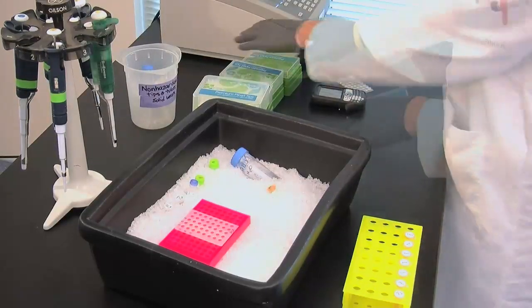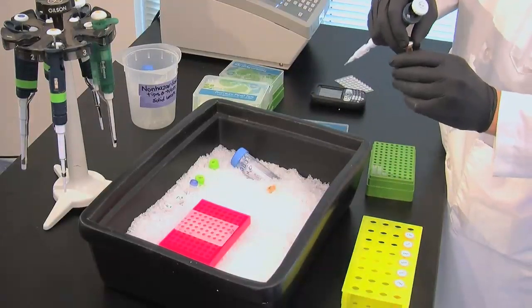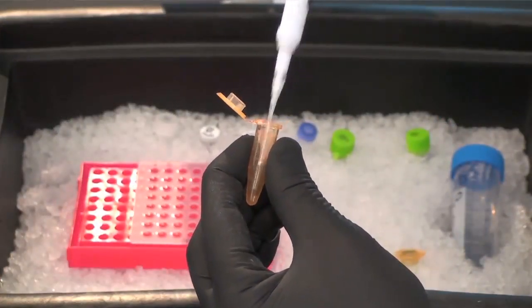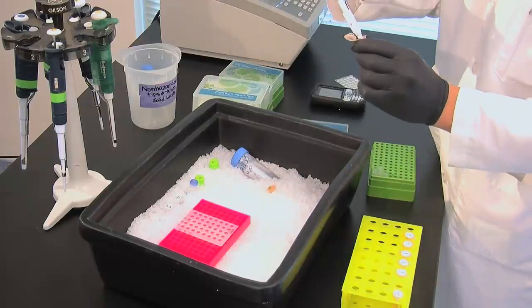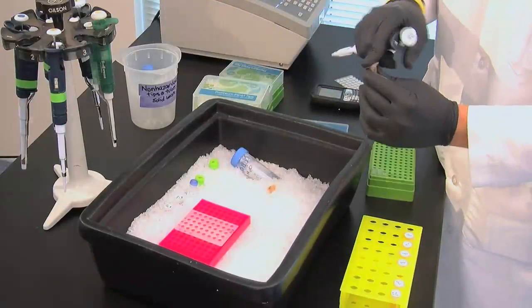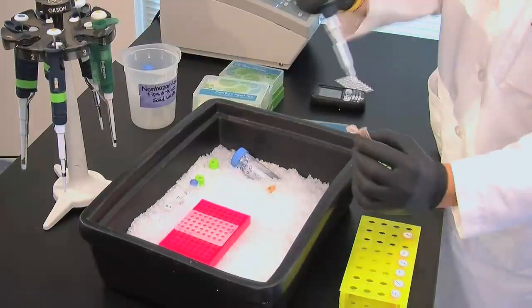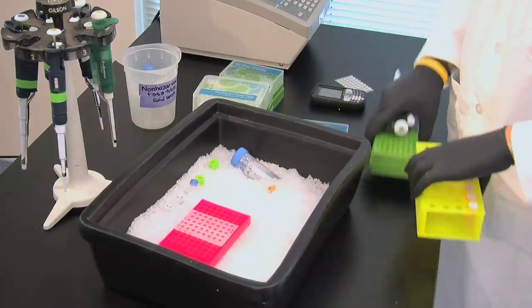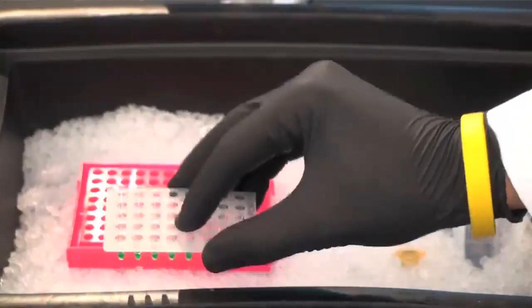Use one microliter of each DNA sample. Go up and down a couple of times to make sure you get enough DNA and a mixture of everything that's in there. Tap it down so that there are no bubbles at the bottom.